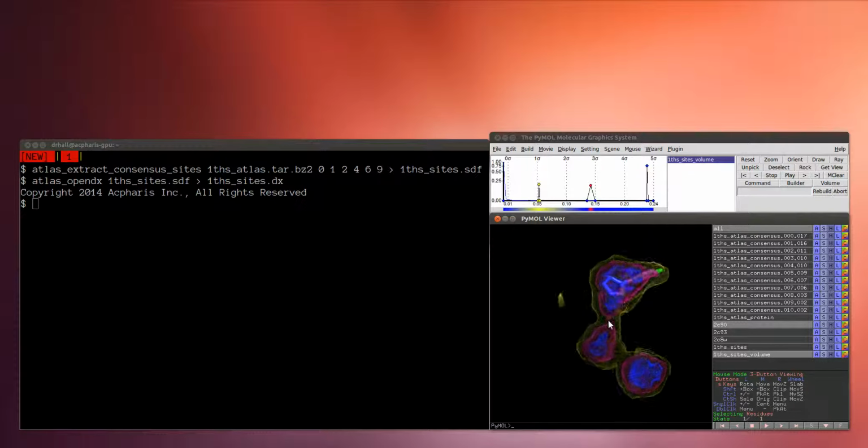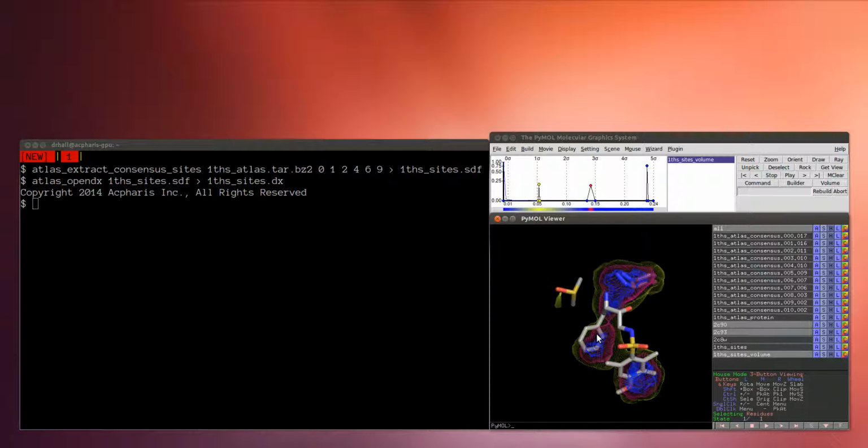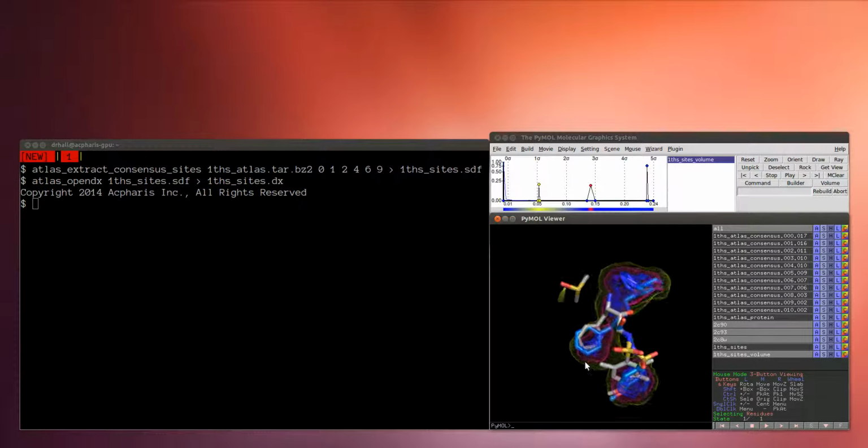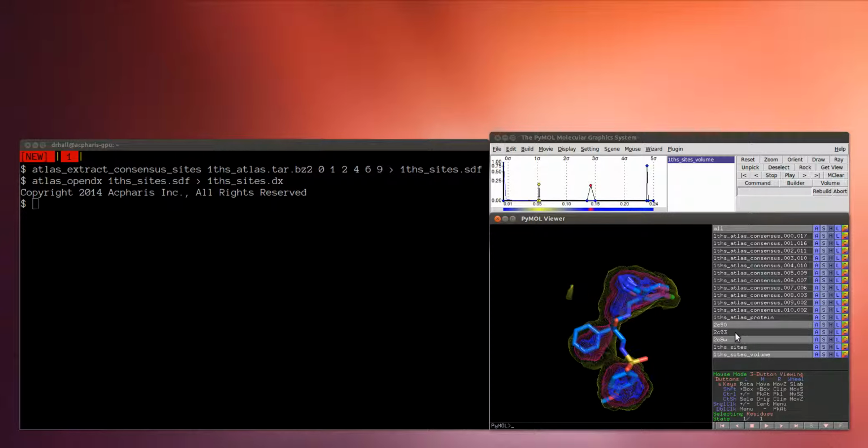In this case, we can go ahead and look at another fragment that came out of Astex's hits. We can see that it agrees decently with our density when you consider the fact that we mapped an unliganded protein. We find the general area for where these two rings are, and we can also look at the molecule that's created when these two fragment hits were linked together.